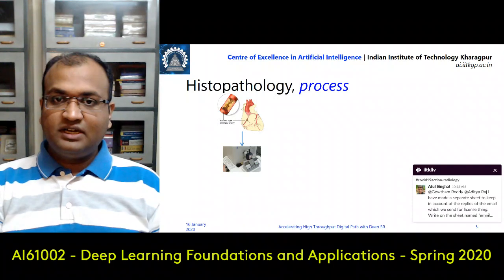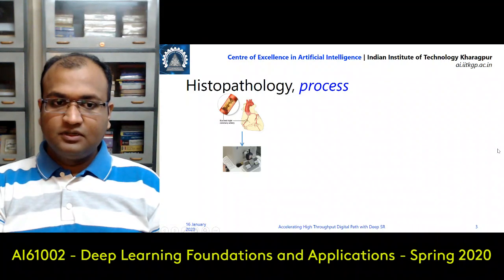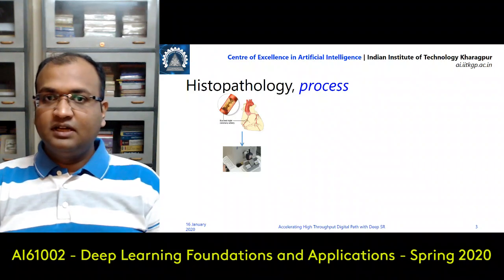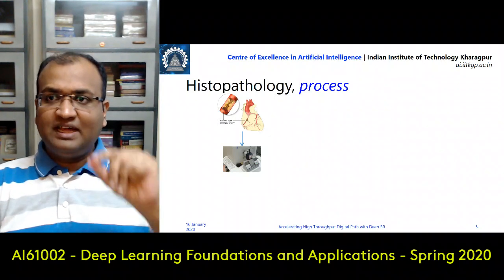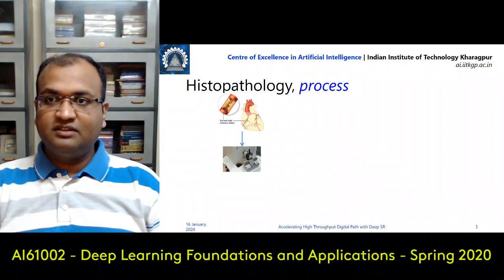So this whole thing, you can take it up, and you can take all of these things and essentially now slice them down completely. Now that you are able to slice it up, slicing essentially means that you will be breaking it down and getting thin paper-like sections. And these paper-like sections are the things of importance to us.